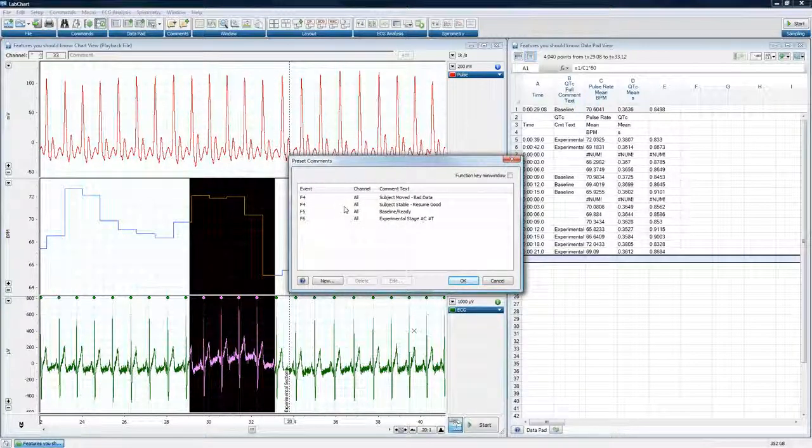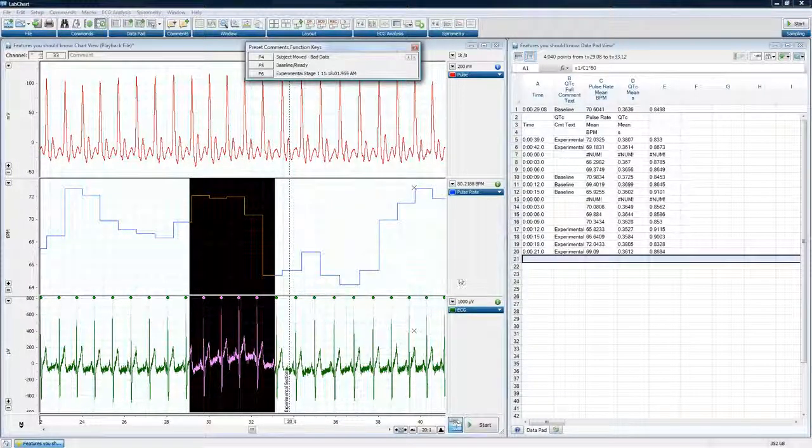These are great. What I'm going to do is show you some differences between the way these are set up. I'm going to go to my function key mini window here, and click on OK.